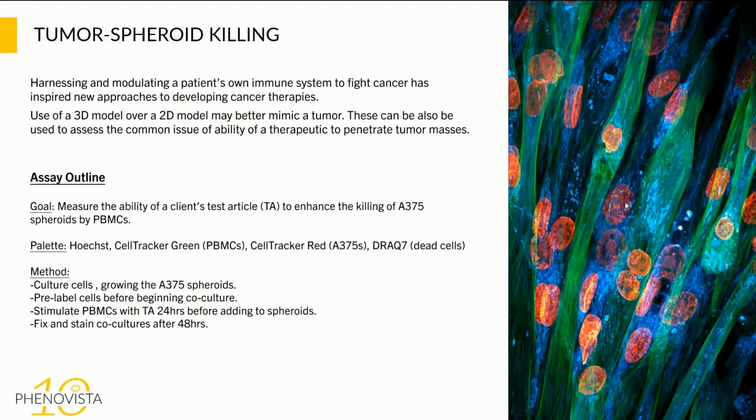These 3D models are also asked for a lot, because you can answer questions with imaging that you might not be able to with other types of assays. For instance, how deeply a therapeutic candidate can penetrate into a tumor, so how effectively it can go into the tumor and access those cells to have more effective killing.